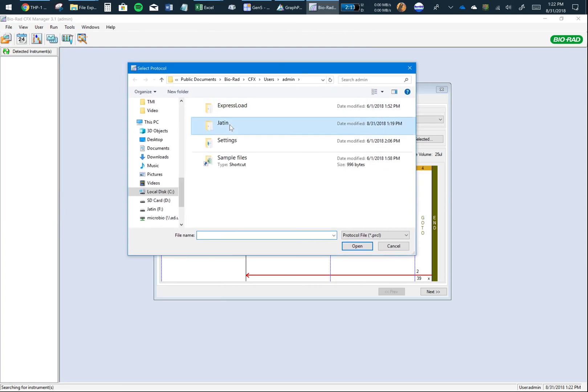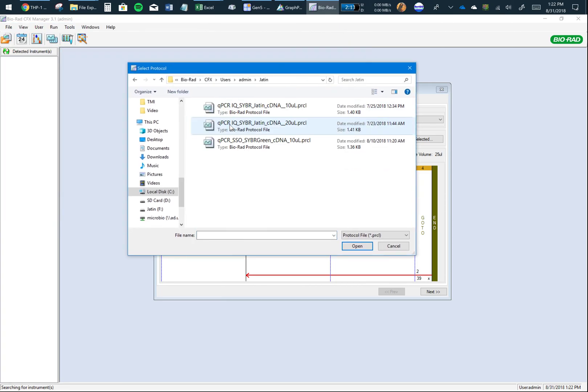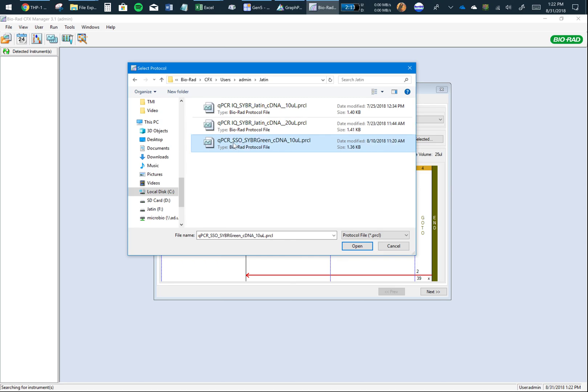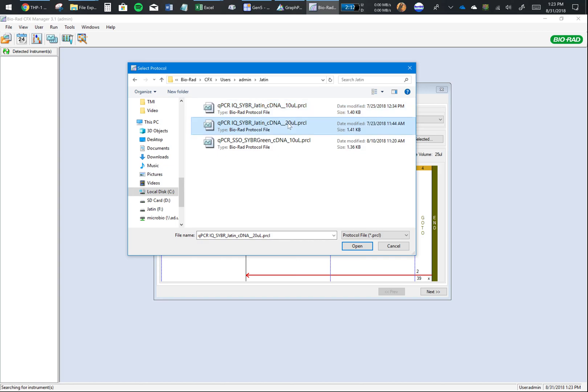Go to the folder. I have made two SYBR Green protocols - one is for the iQ SYBR Green, which is a different brand compared to the SSO SYBR Green. I've also made different ones based on the total reaction volume I'm using. Currently we're using the SSO SYBR Green at 20 microliters, so I would double-click on this.